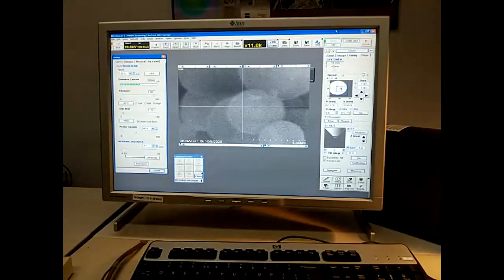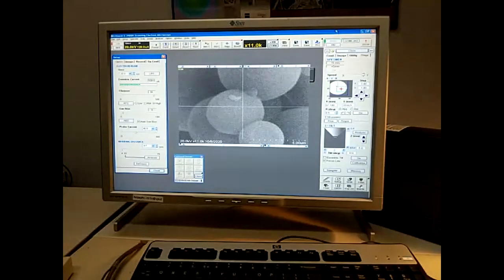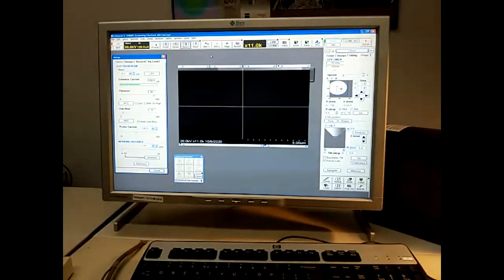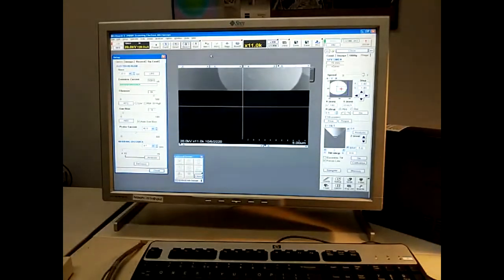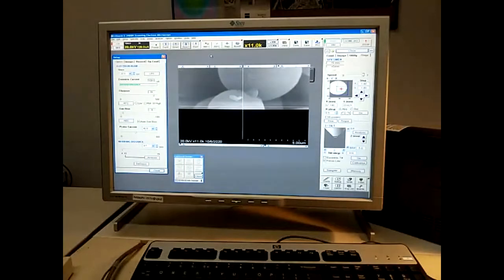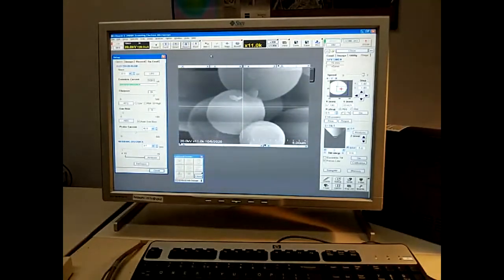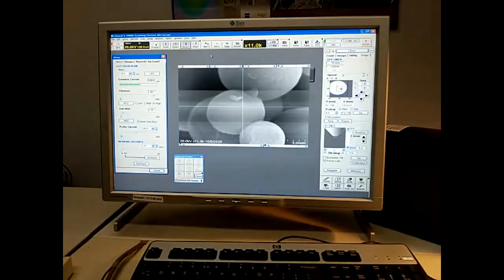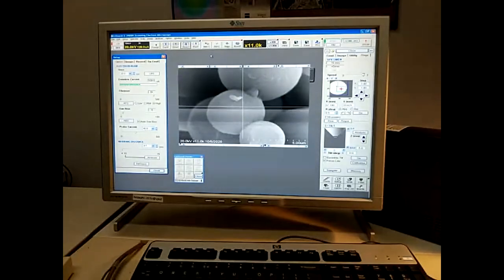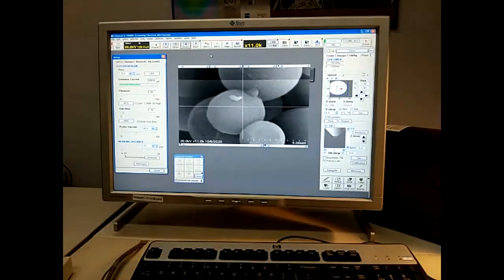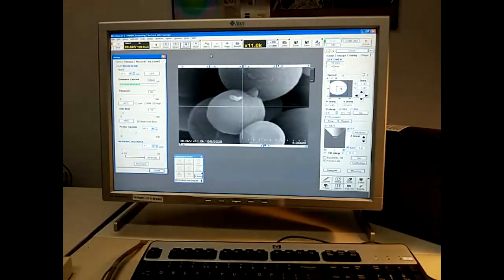Back to slow mode. Turning up the contrast, adjusting the brightness a little. This brings out some of the fine detail. These are coated silica beads with various different types of materials on them.